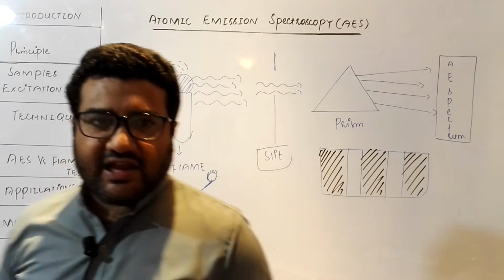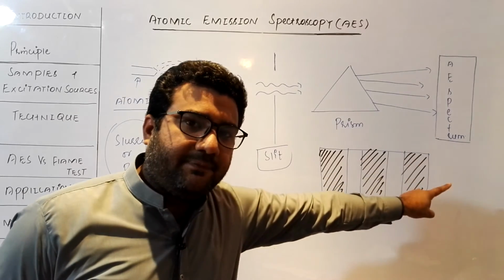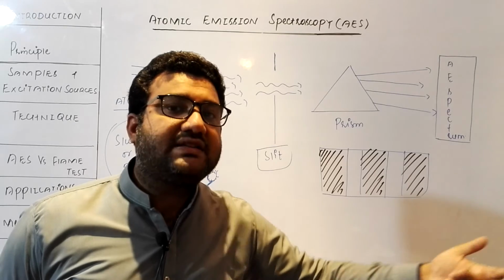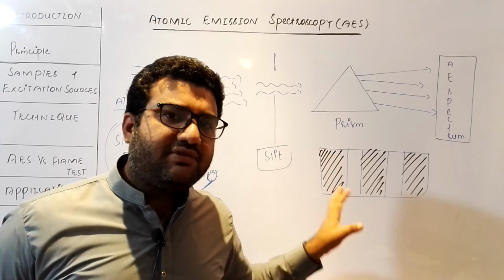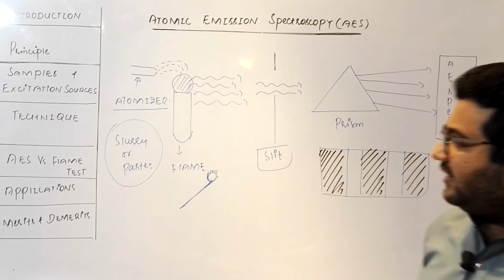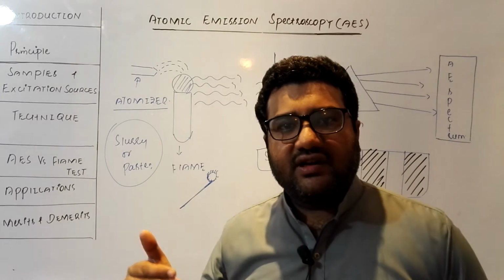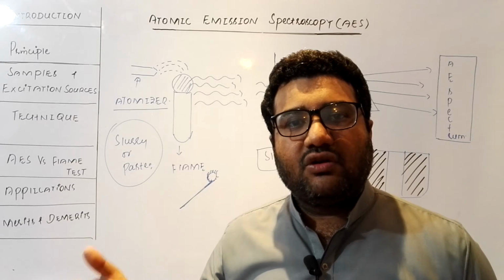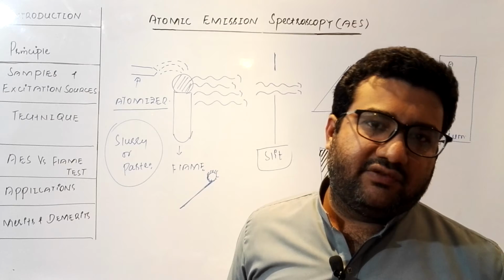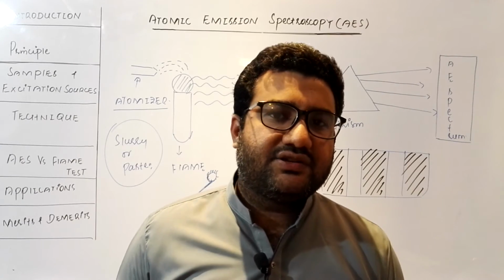Atomic emission spectrum has bright spectral lines because these are the energies which are emitted. These are the photons which are emitted. So the emitted photons appear in the form of the bright spectral lines, while those which are absorbed will have the dark background. So the background will be dark and the lines will be bright. This is the technique which is used for the detection of the atoms of the different elements, because atomic emission spectrum of every element, every atom, will be different from all other atoms depending upon the photons that were emitted during the de-excitation of the electrons.